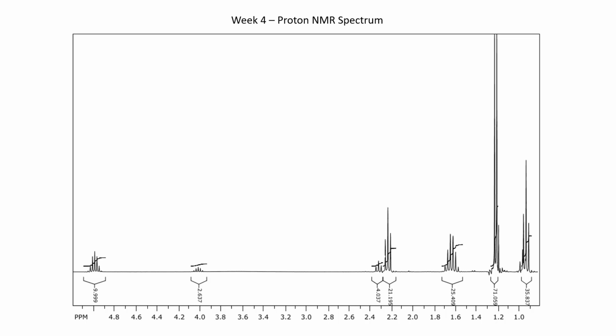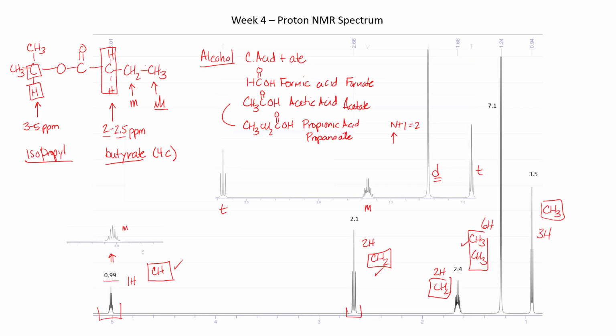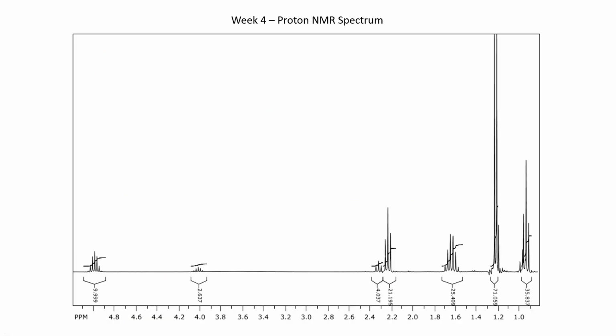And they had actually saved the spectra, which I will do from now on because I don't normally do that. I just print it. So here is student data for isopropyl butyrate. You can see it's not very clean. It's not as clean as the spectrum from before. There's just a multiplet, triplet, multiplet, doublet, triplet. In this spectrum, we've got a lot more. So what's going on here?